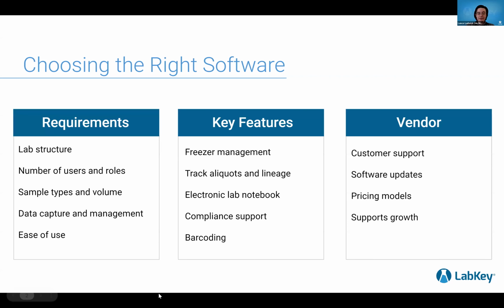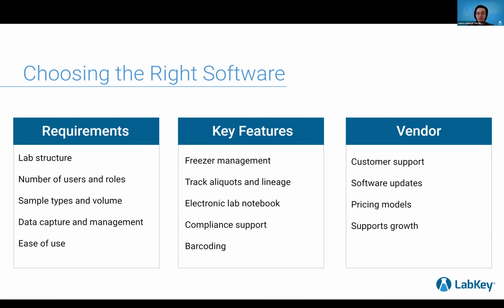When we're looking at sample manager software, it's important to understand the key requirements of what we're looking for. With that poll we tracked some of those requirements that you need, but you might also want to consider the structure of your lab. If you have multiple labs or departments that need to share information with each other, or if you need to partition that data.